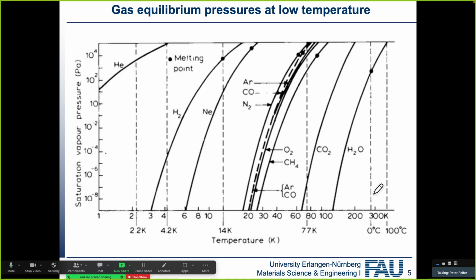Okay, so for us, the important bit now is what contaminants we can have, which contaminants give us problems, and how to get rid of them. This is the whole heating issue. The important thing for us is the vapor pressure. Here again in pascals, so 10 to the minus 8 means 10 to the minus 10 millibars. This is roughly where we want to end up, versus temperature.